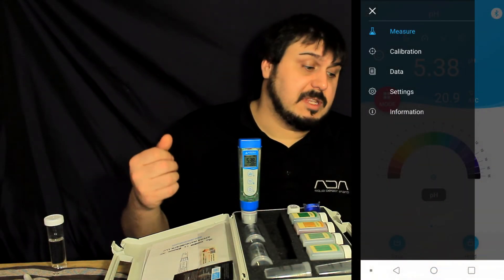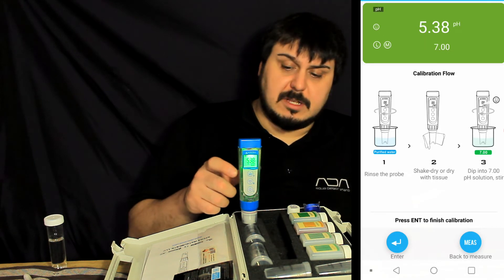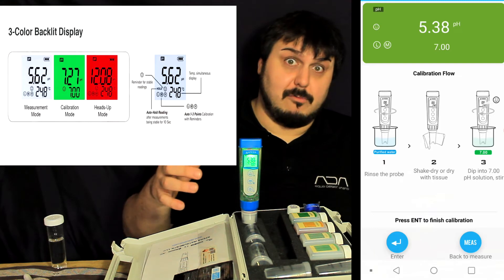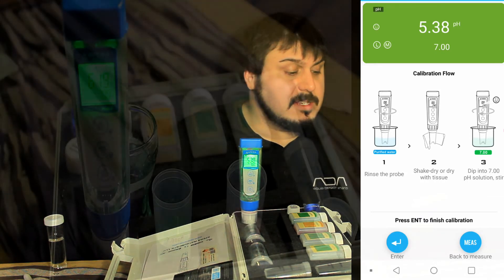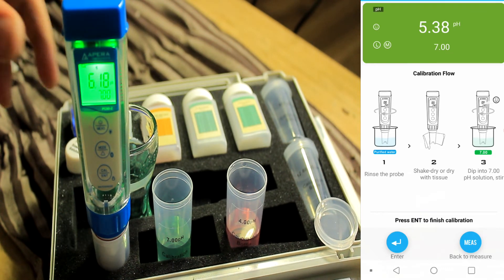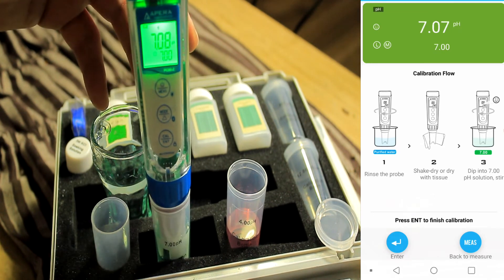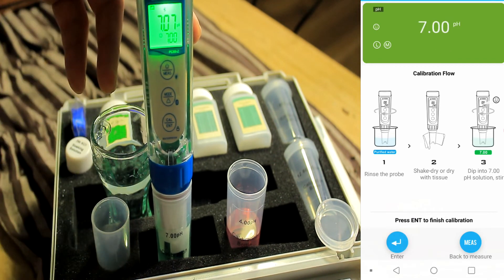The calibration is made super simple with this app. Once I click the calibration button, the screen turns green — there are actually three colors. Red is a heads-up mode, which activates if something is going wrong, like an unstable reading. Green is for programming mode. As you can see on screen, you take the two calibration liquids, dip it in one, wipe it, rinse with purified water, then dip it into the other. It's as simple as pressing enter on your phone and it programs the pH for you. Very easy to use, and this is one of the things that really attracted me to this product.